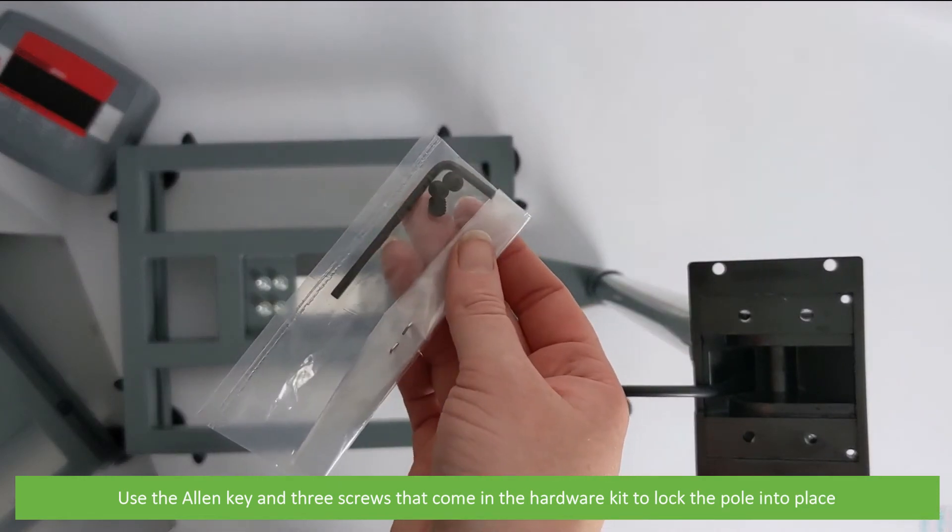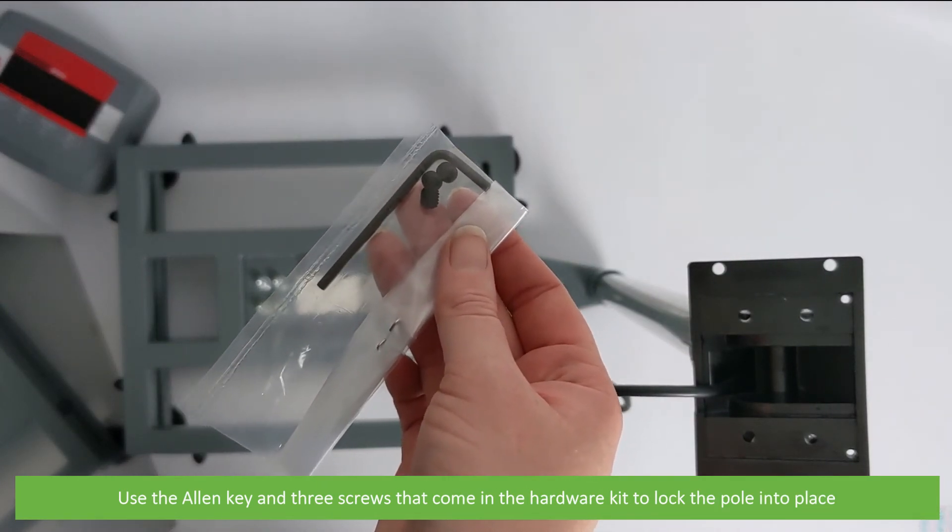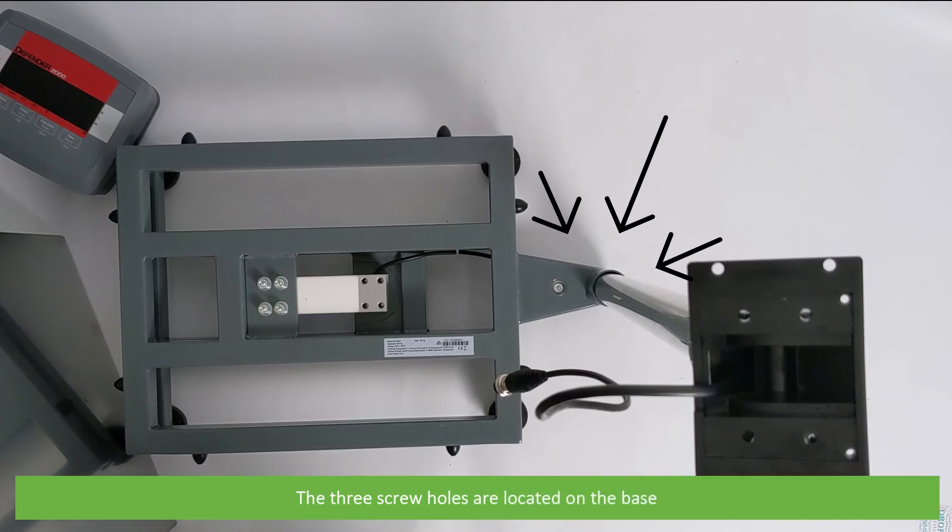Use the allen key and three screws that come in the hardware kit to lock the pole into place. The three screw holes are located just on the base.